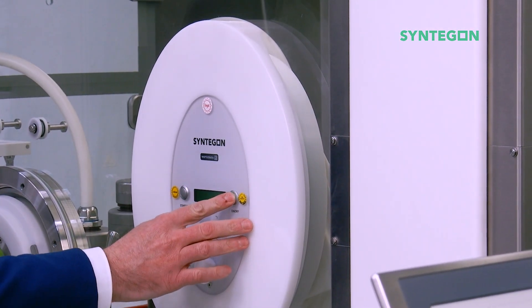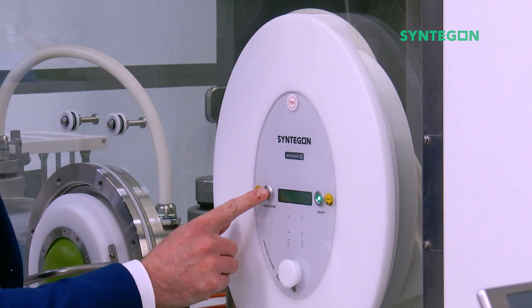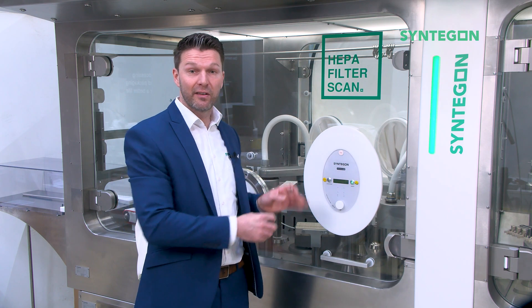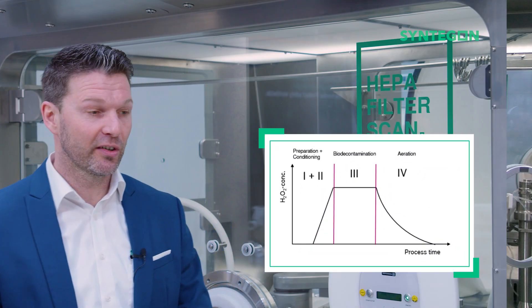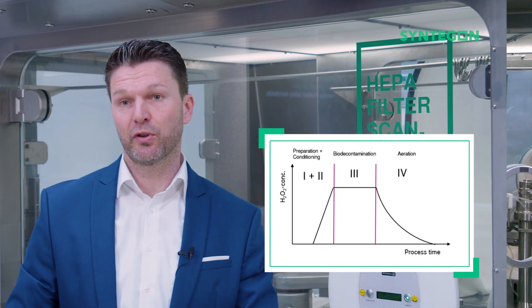Press the on-off button to power up the device. Press the start-stop button on the device. Then the integrated sealing inflates to a pre-inflated pressure of 800 Pa. Then press the start button on the HMI to trigger the test procedure.